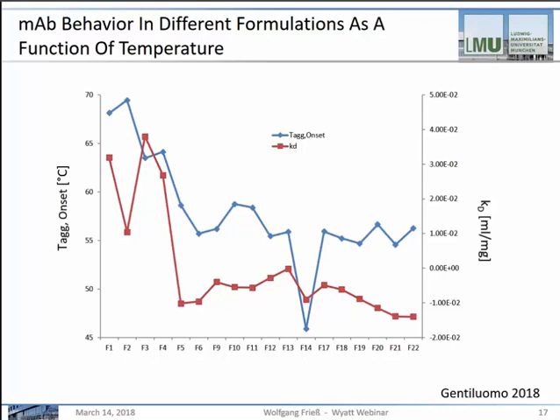What you also see is the temperature of aggregation, the onset of that, meaning that unfolding starts. What you see is that already at higher repulsion, when the Kd is higher, the temperature at which aggregation starts is also higher, because we come initially from more repulsive interactions.